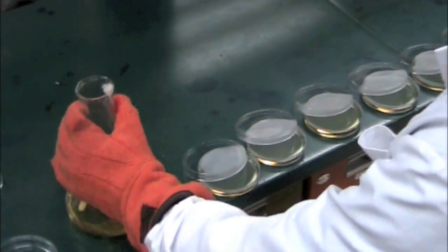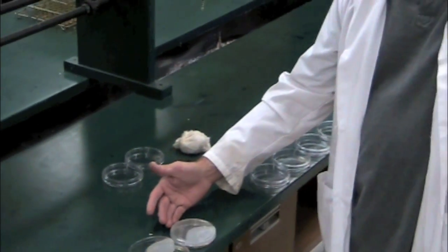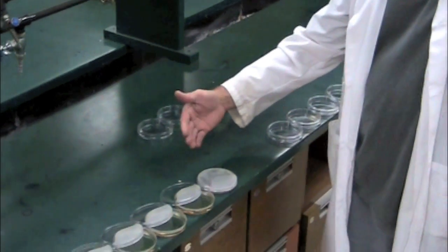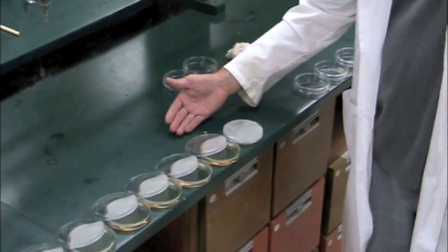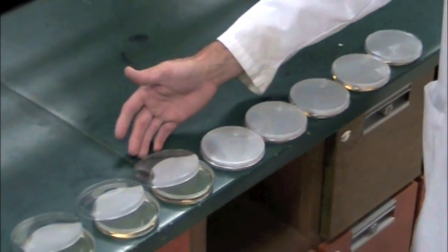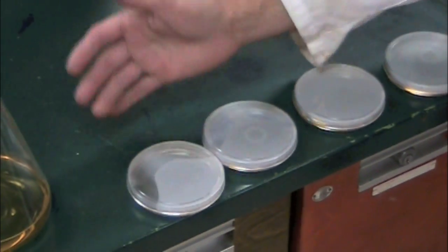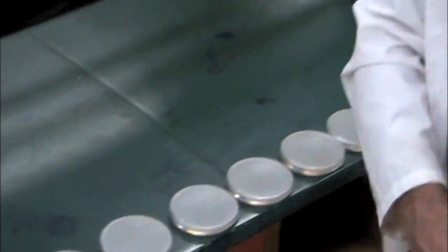I've poured all ten. Now I'm going back from the side — I don't want my hand passing over the plate and bacteria falling off. So I'm pushing the lid on from the side, working my way up, pushing each lid on from the side of the plate. And that's how you pour plates for the microbiology lab.